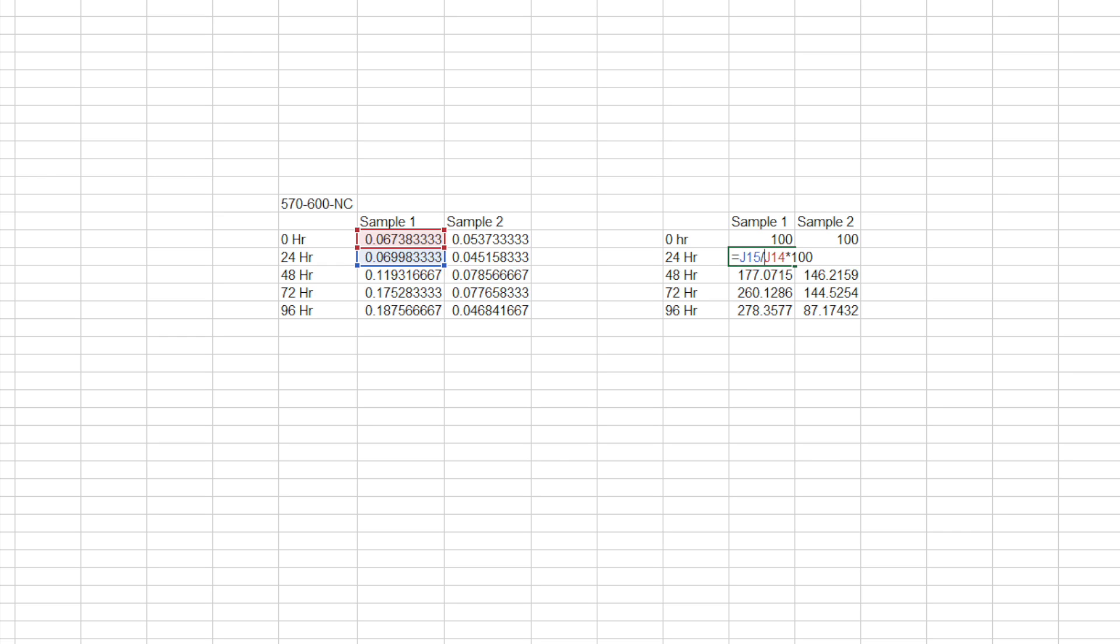And as you can see below, these are percentages of what it was at the original. So for example, sample one at 96 hours is 278 percent more absorbance than at hour zero. And that's what you're going to be able to graph later on. It's important to do this because if you just graph the absorbance, it's kind of hard to see the changes but this is going to allow you to see it on a better scale.